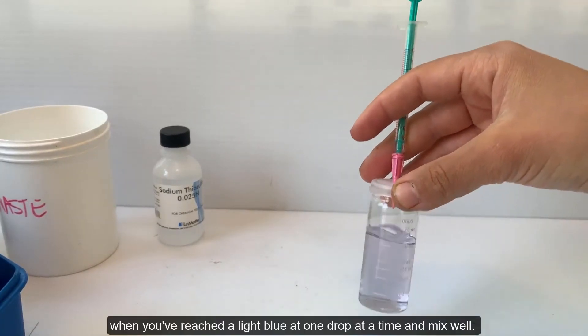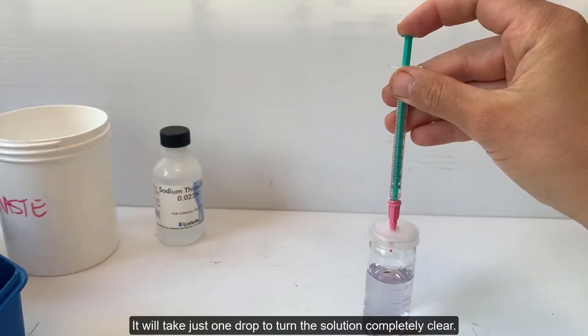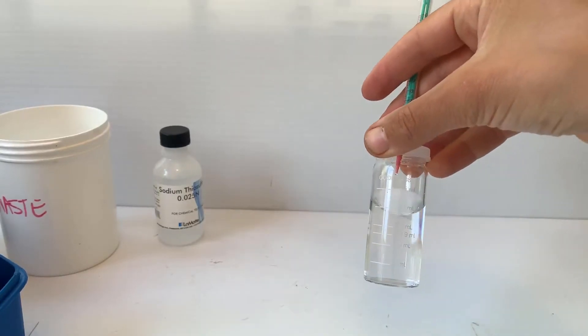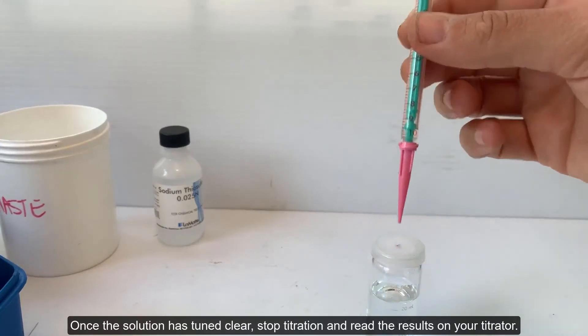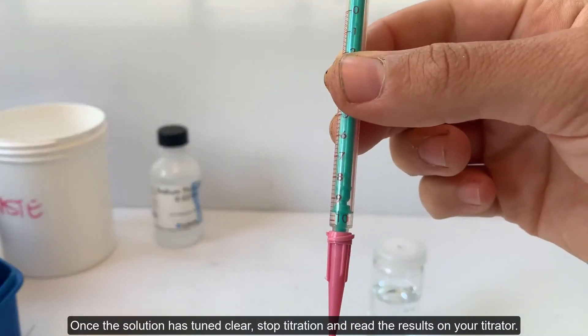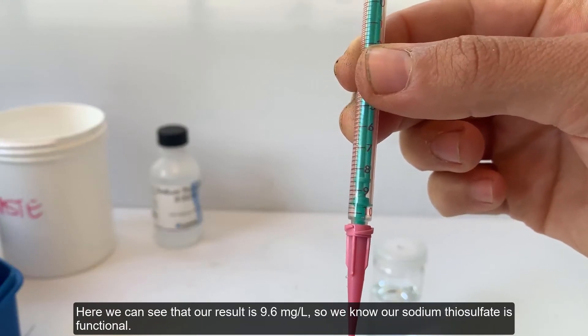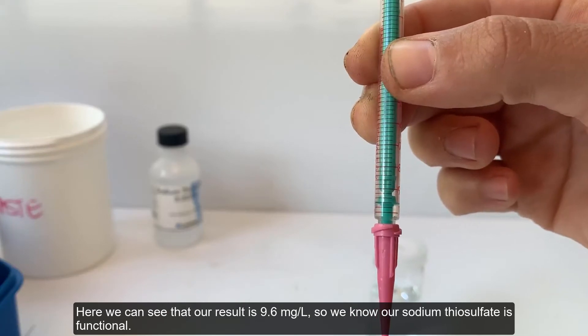When you have reached light blue, add one drop at a time and mix well. It will take just one drop to turn the solution completely clear. Once the solution has turned clear, stop titration and read the results on your titrator. Here we can see that our result is 9.6 mg per liter, so we know our sodium thiosulfate is functional.